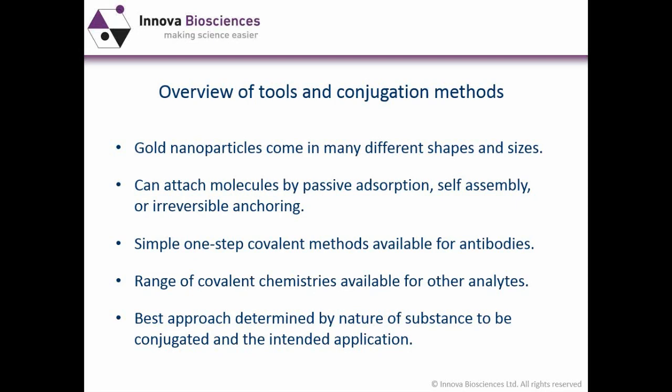The best approach in any situation is going to depend on the nature of the substance that you want to conjugate and the intended application. And it's just a question of screening. It's a screening exercise really to find the best combination for your particular antibody or small molecule.